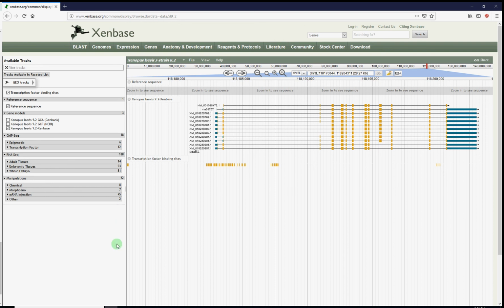And it harmonizes, it works in tandem with the hierarchical track list too. So whatever you select there will be selected in these checkboxes here too. So this faceted track selector and everything you see here, the way the tracks are sorted and ordered, it's identical basically for the Tropicalis 9.1 genome as well. So just a different set of GEO tracks available there, but all the functionality that you see is available there as well. So that's how you can explore the GEO tracks and use the faceted track selector.